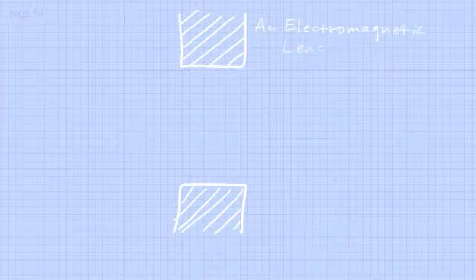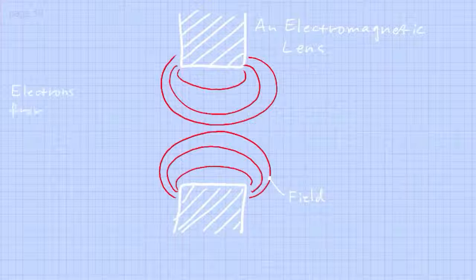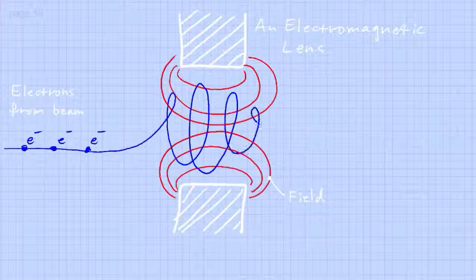the lens. One drawback with electromagnetic lenses is that when the electrons are focused by the lens, they will make a spiral pathway when they go through the lens. And that will affect the image that you produce on a screen below. You usually have a fluorescent screen at the bottom of the microscope that emits light when it is hit by the electrons, so you can see the image with your eyes. If you change the strength of some lenses, for example you change magnification or you change the focusing level, the image will rotate.